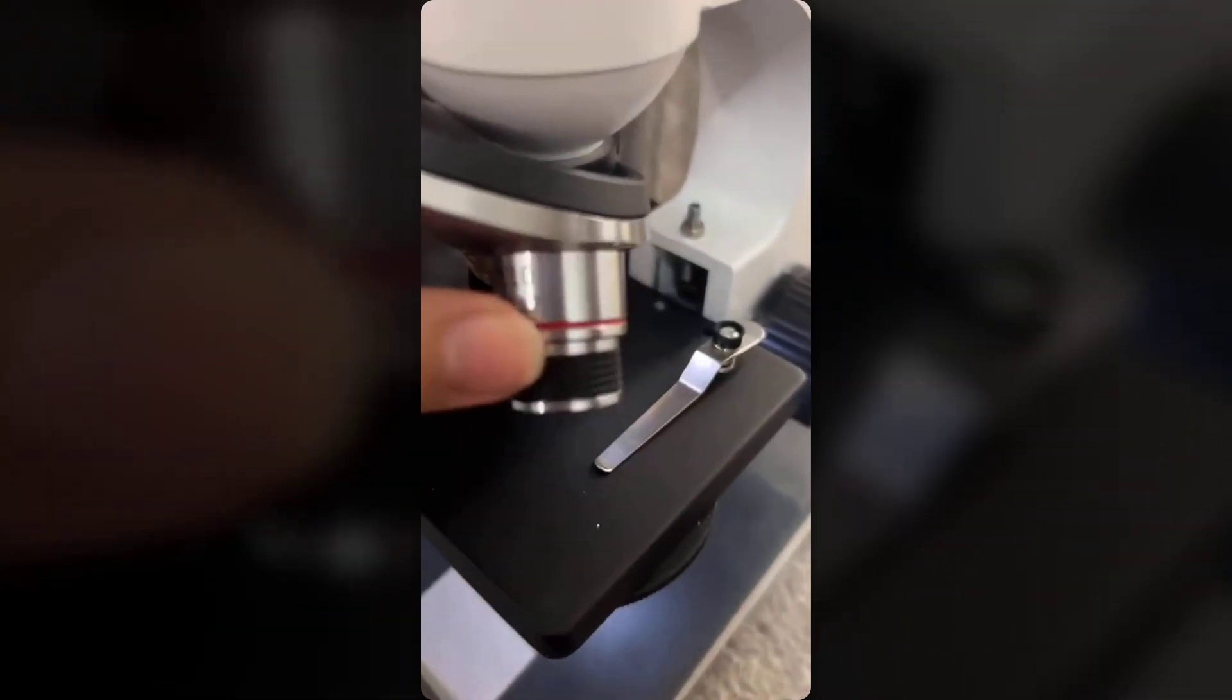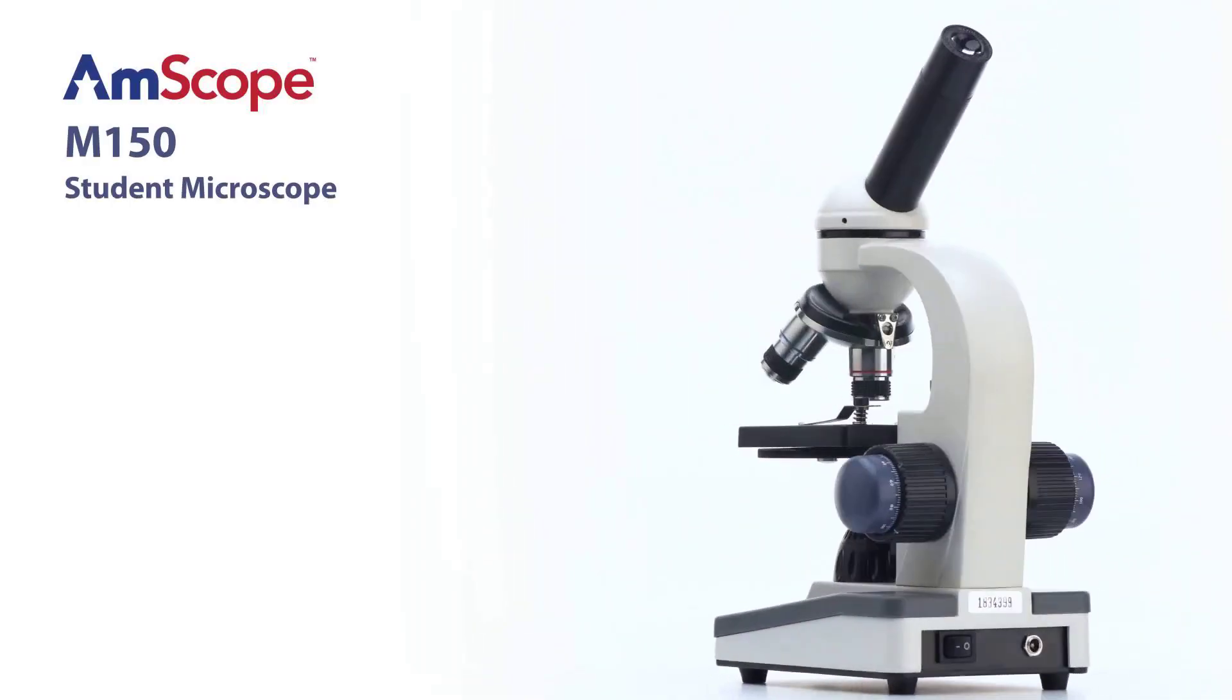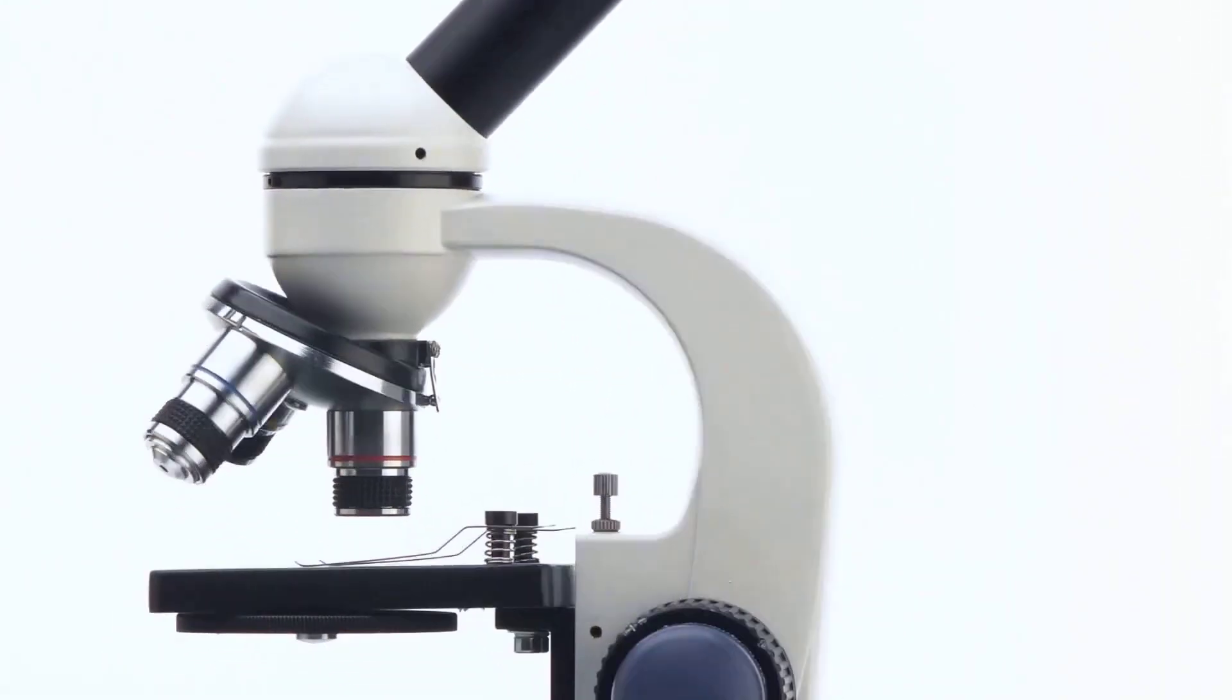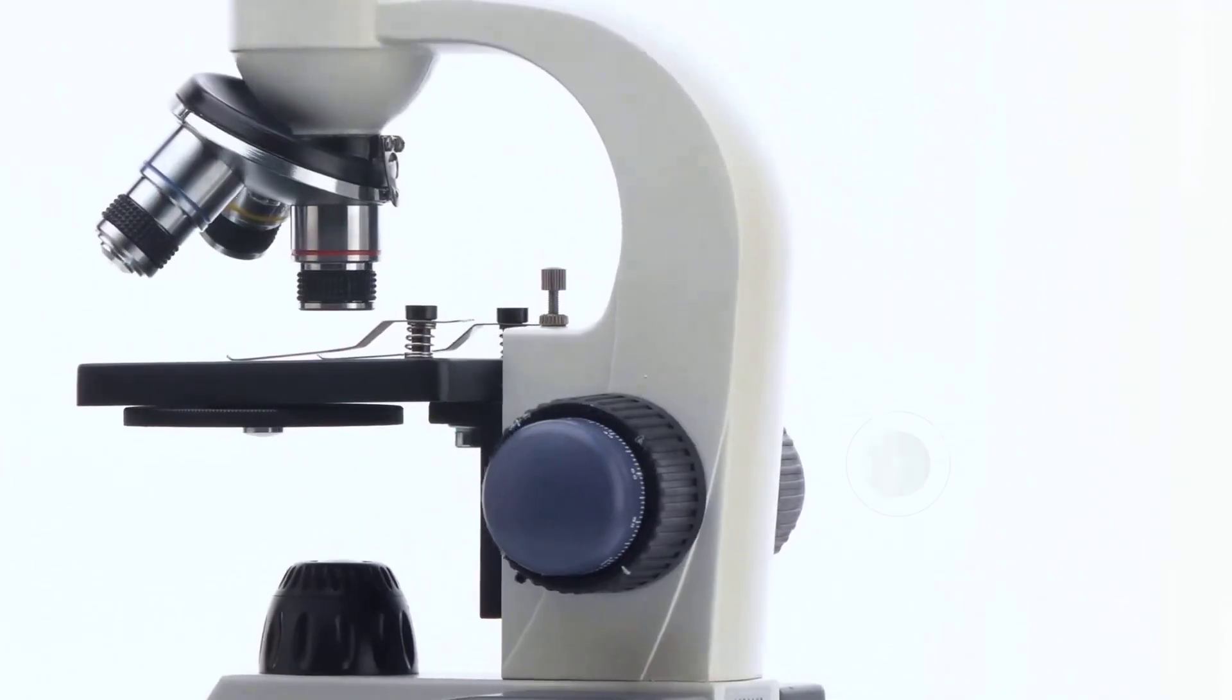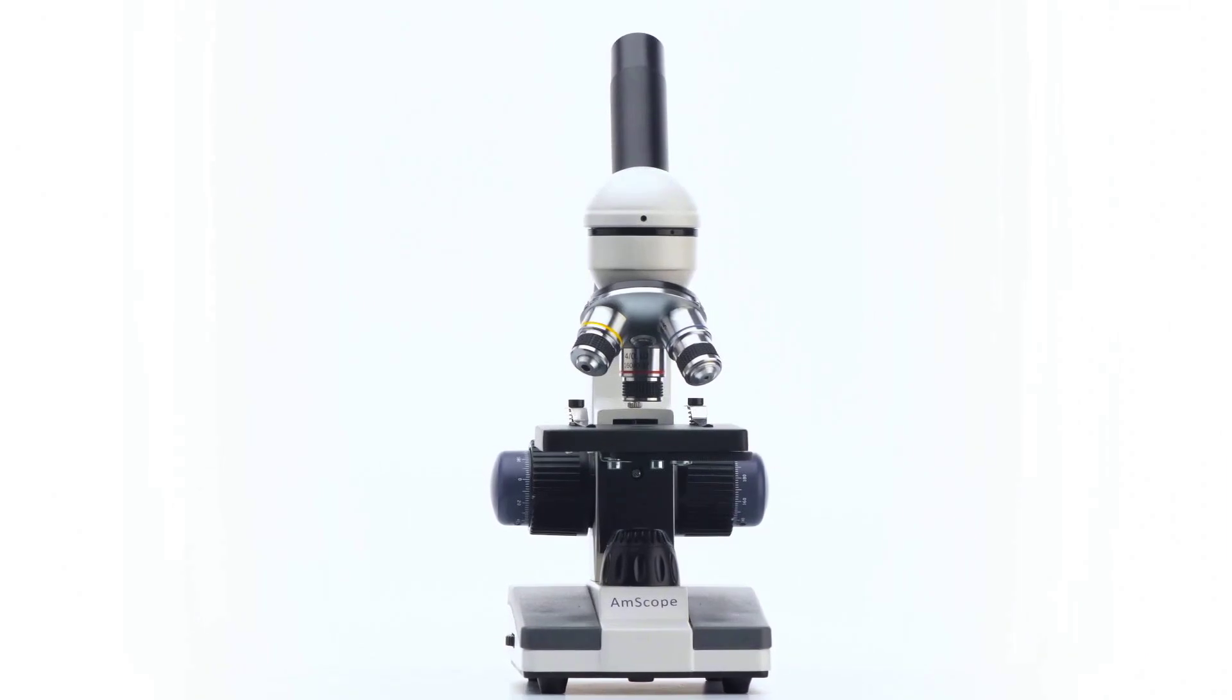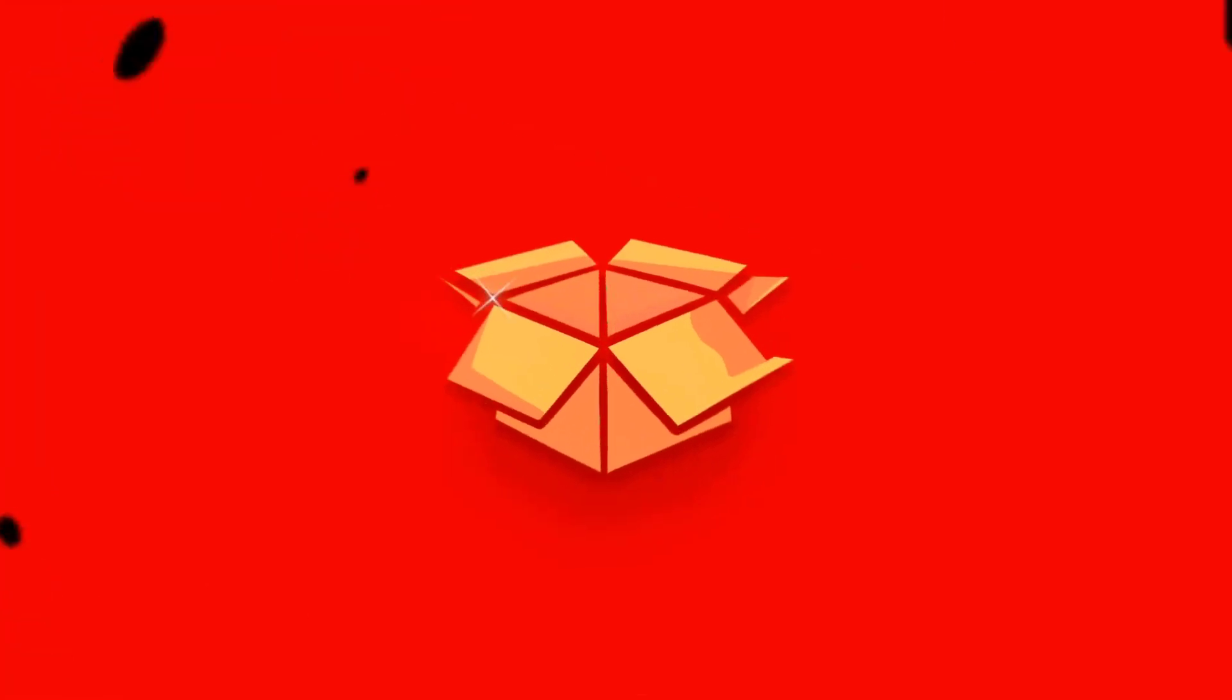The thoughtful inclusion of a protective dust cover and backup eyepiece enhances the overall package. Although other options include more extensive slide collections and accessories, the M150 emphasizes essential functionality and mobility. This focused approach makes it particularly suitable for beginners and educational applications, delivering professional-grade performance at an accessible price point. The Amscope M150 represents outstanding value in its category. Its combination of durability, portability, and superior image quality creates an excellent tool for microscopic exploration. While it may not include extensive accessories found in other kits, its streamlined design makes it ideal for users seeking reliable, on-the-move observation capabilities.